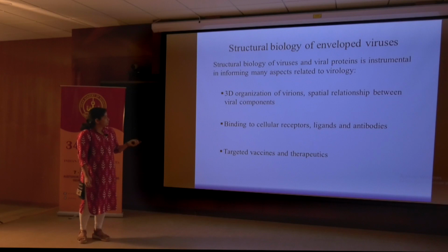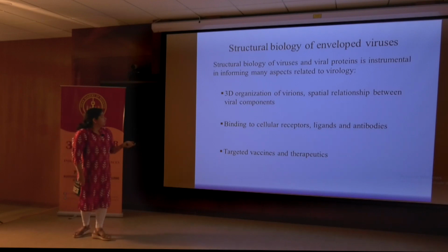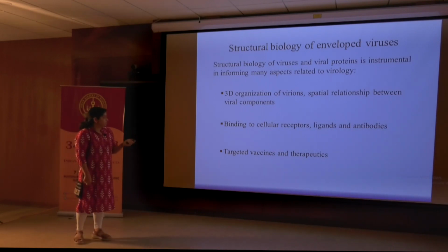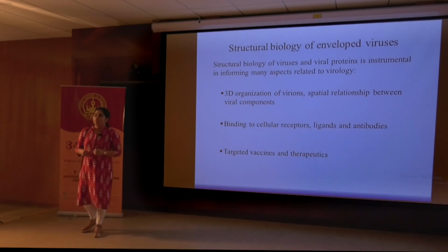And this is another part. If you want to understand the three-dimensional way in which these different proteins and components dock together, then structural biology really helps you get high-resolution insights into it. All of these also give you a better idea of how to design targeted vaccines and targeted therapeutics.